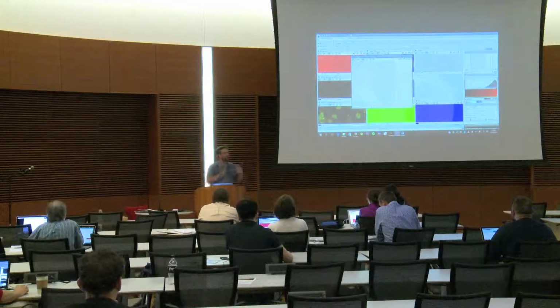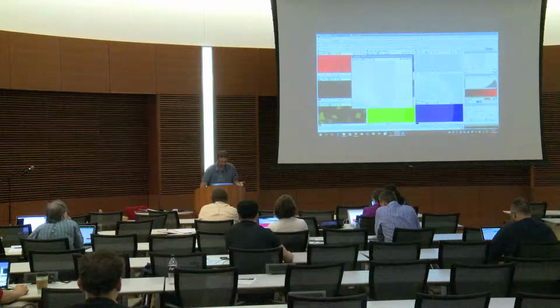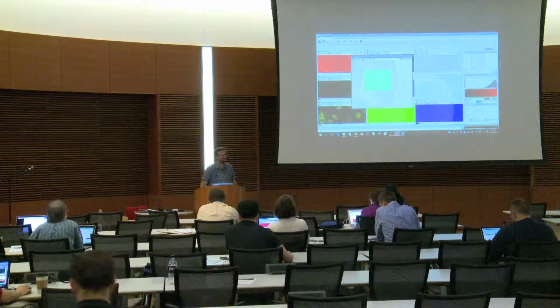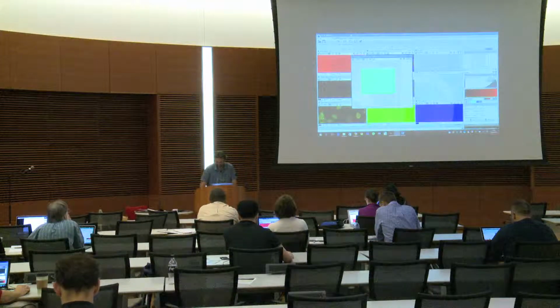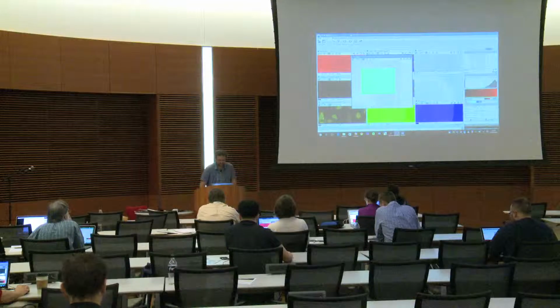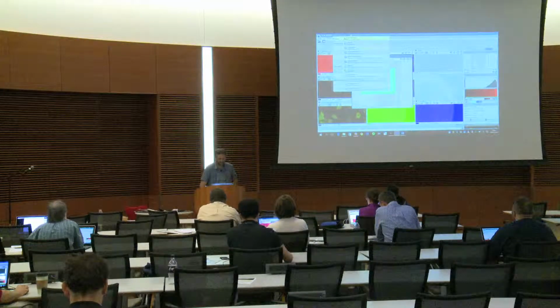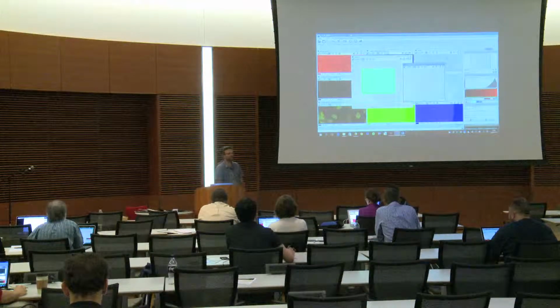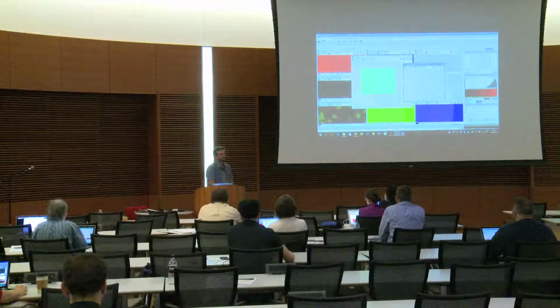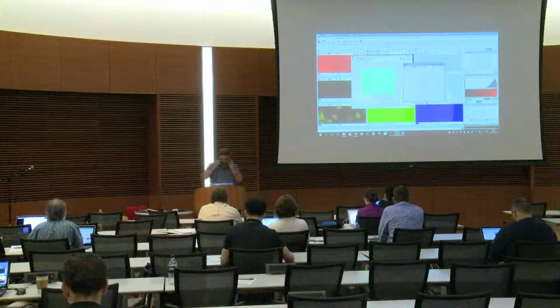And then for all the basic things that you need, you will never need to search for it. So if you want to crop the image, you create a rectangle like this. So it's in the ROI tab here. And here you type crop, and you click, and you have the crop that is performed. Okay? So we really try to make it easy.